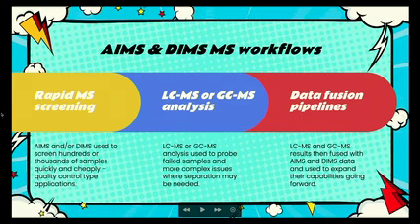Find out the ones that you think might have a problem, ones that are suspicious, ones that are of concern, or ones that are completely free of contaminant, free of an adulterant, show no sign of having a marker of interest, and then put them back in the freezer and forget about them, and leave samples for more thorough analysis that you think have some sort of quality that you're interested in, whether it's they've got a fraudulent application or whether they've got some sort of biomarker that you're interested in.